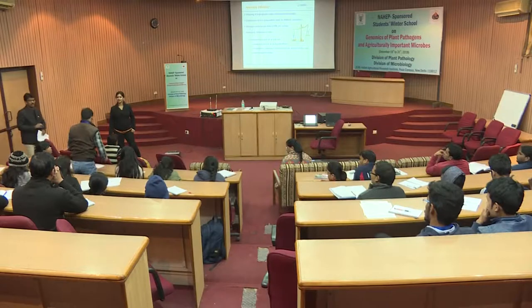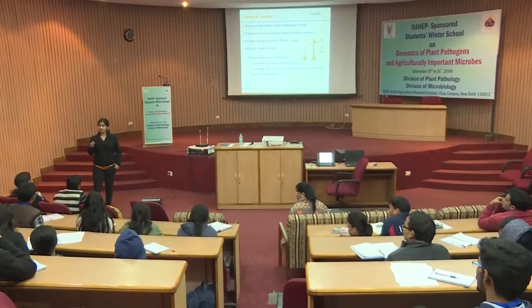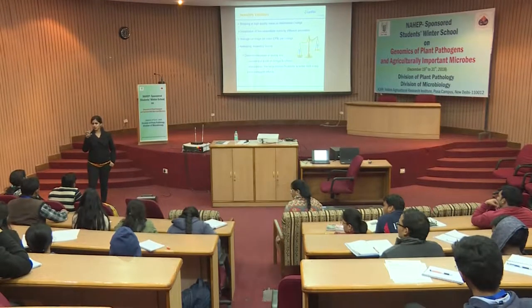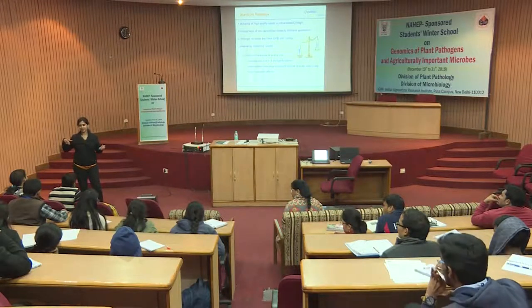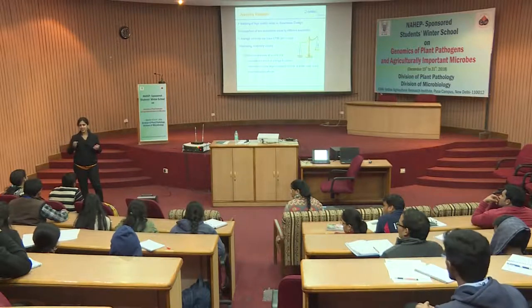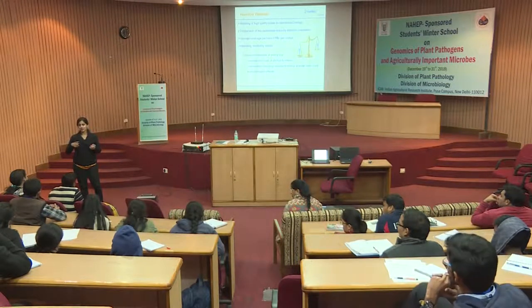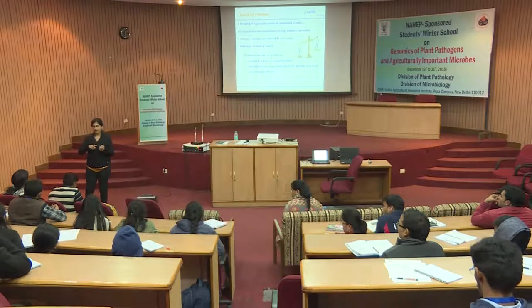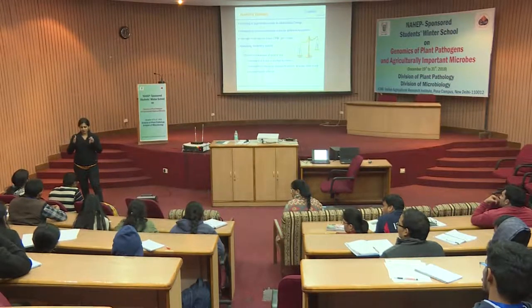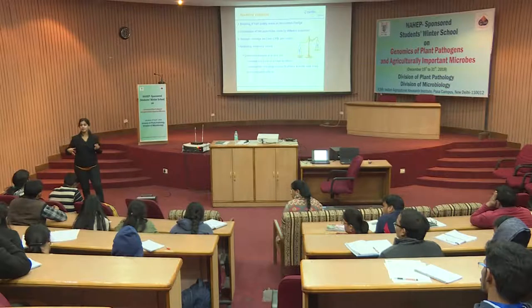What is the difference between systematic error and random errors? See, random errors are in these long reads. The sequencing chemistry is very different. It is based on polymerase, right? When you are sequencing repeats, when the repeat comes, the polymerase slips over and cannot sequence that path. So, the read breaks at that end and it may skip that region or may sequence something else, introducing something there. For example, we recently did a very complex fish, in which we had somewhere around 85% of repeats. The output of that particular SMRT cell is 5 GB, but we could only get 1 GB per SMRT cell because the polymerase was just clipping off and slipping down.